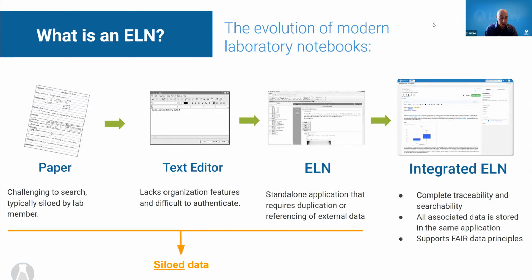Very often that's done through things like templating. They also sometimes provide version control for your notebooks, allow you to limit who can author notebooks or edit them after signatures. These are genuinely helpful, but that separation of that data capture and storage from the authorship remains.